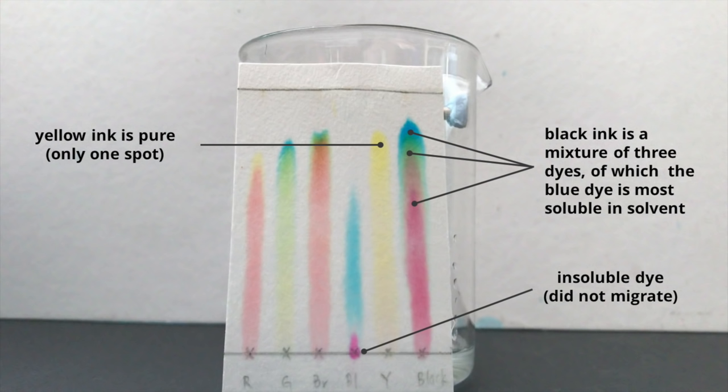The blue ink is a mixture of two different dyes, one blue and one purple. And the purple dye is insoluble in water, that's why it remained at the start line and did not migrate up the paper.